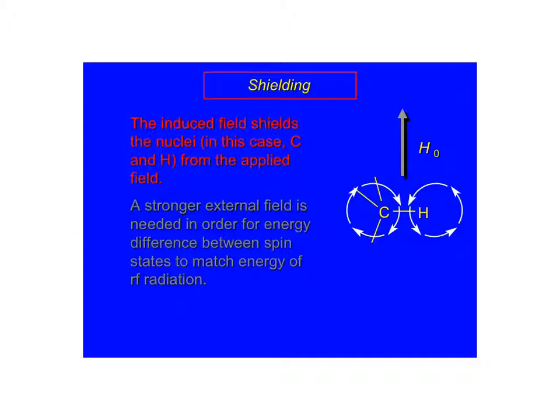And so the effect of the electrons, the apparent feeling of what the nucleus on the inside feels, is called shielding. Okay, so the electrons are shielding the nucleus on the inside from that magnet. It's not going to shield it completely because the electrons are puny, but over the bigger scheme of things, it affects it ever so slightly.